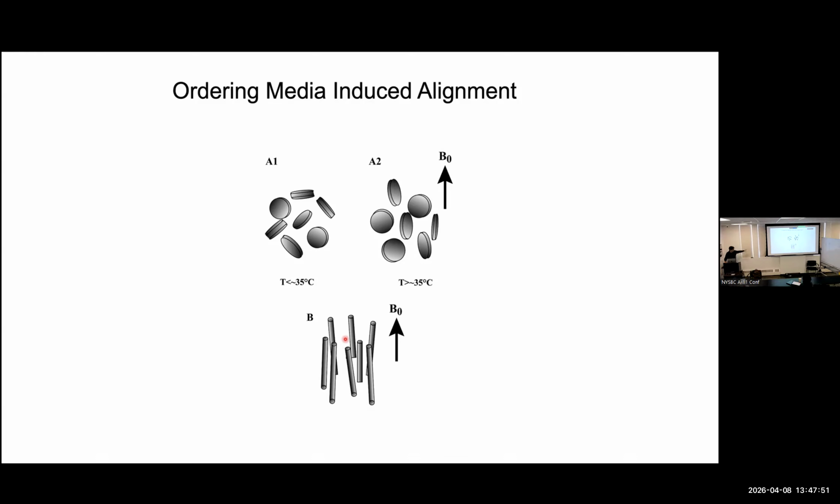I like that idea. So you're saying the solvent around the ordering medium is itself partially aligned. And maybe if I share the solvent with the molecule, then the alignment gets transmitted to the molecule, like a transfer of alignment. That's a good way of thinking about it.